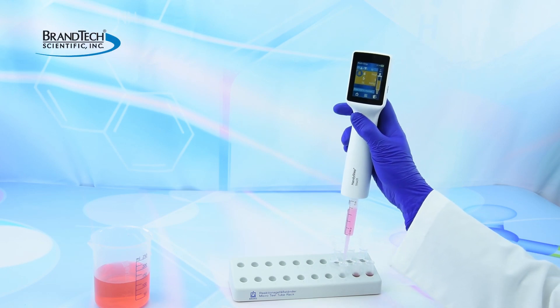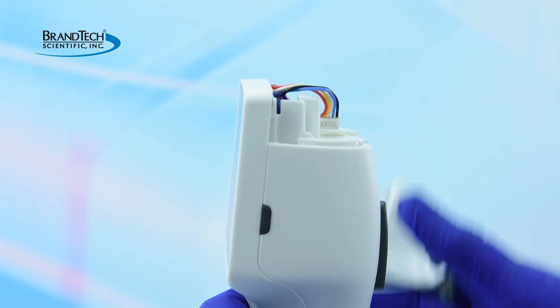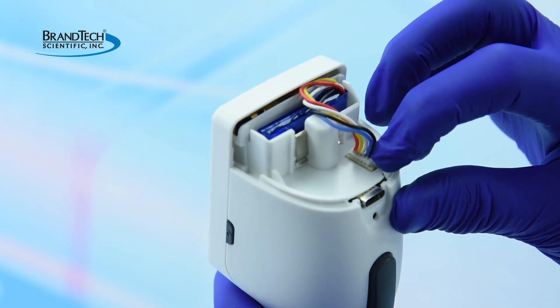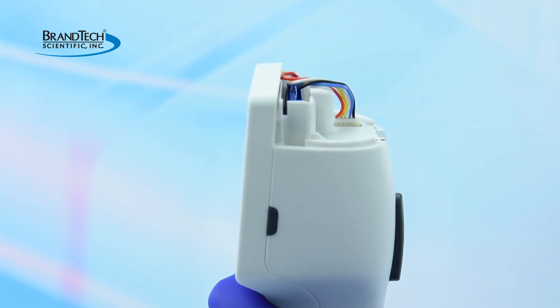The Handy Step Touch is shipped with the battery unplugged. To connect the battery, remove the battery cover and insert the battery plug into the socket, then replace the cover.